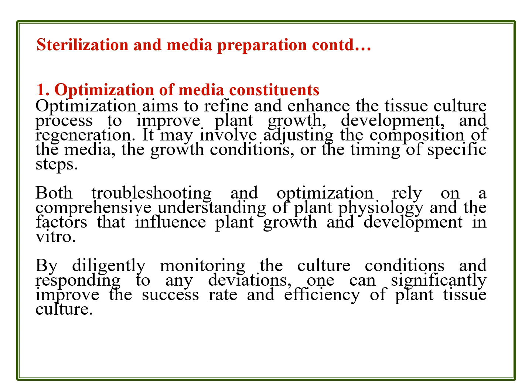And based on the objective, if it is callus cultivation or callus growth and development, the growth regulators are optimized. That is, for a callus, an increased concentration of auxins and a lower concentration of cytokinins will be incorporated into the media preparation.